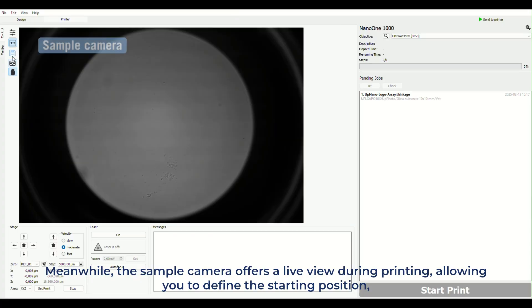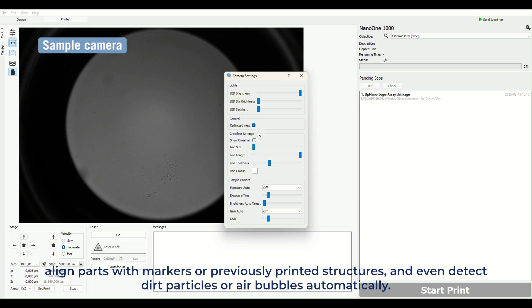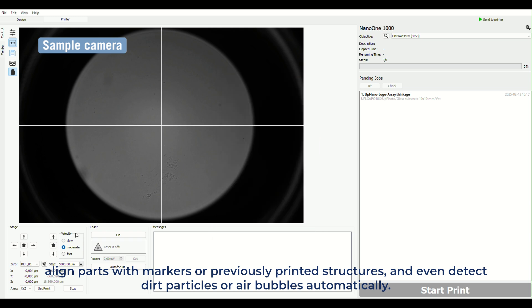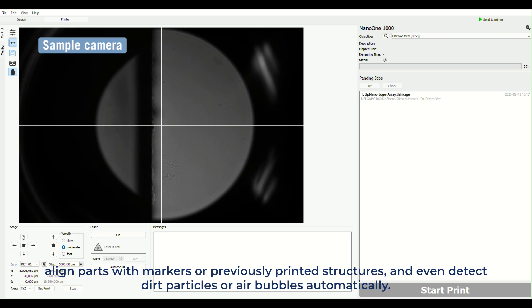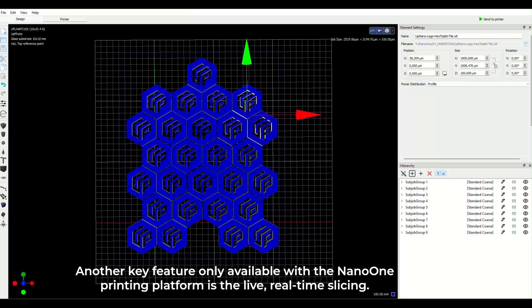Meanwhile, the sample camera offers a live view during printing, allowing you to define the starting position, align parts with markers or previously printed structures, and even detect dirt particles or air bubbles automatically.